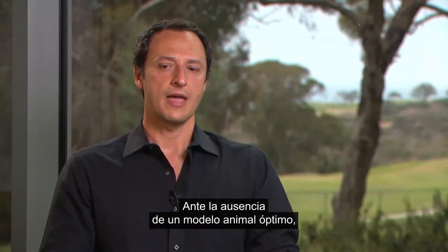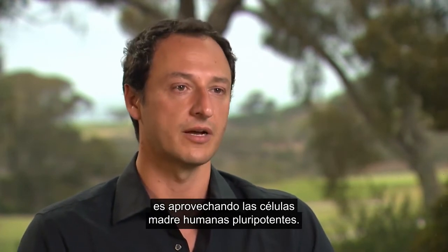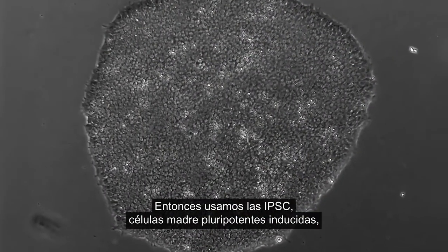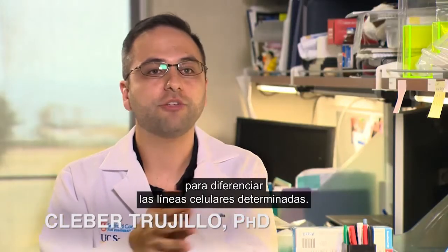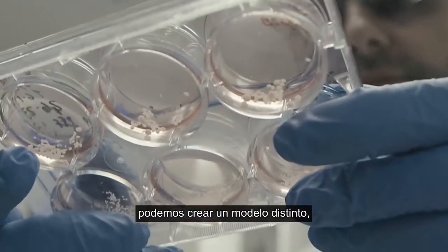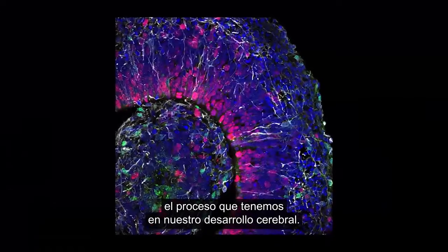With the absence of a good animal model, the only way to study this condition in a human background is to take advantage of human pluripotent stem cells. So we use iPSCs, induced pluripotent stem cells, and embryonic stem cells, create specific mutations, and use these cells to differentiate into specific cell lines. Using these cell lines, we are able to create a different model, an organoid, that recapitulates the process that we have in our brain development.